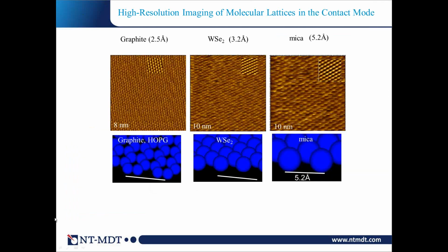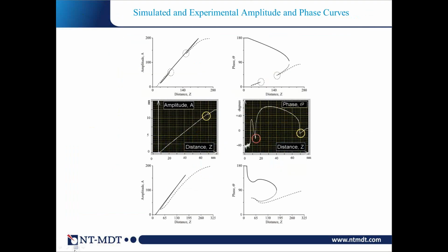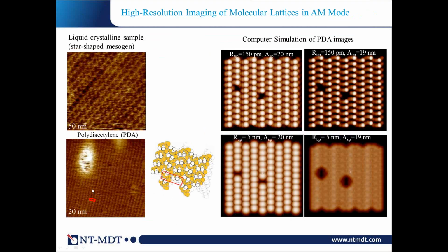Yes, we can get images, and we can get defects, which is evidence. Now the question was, do we learn much from that? This is again in simulation, in work we published with Sergei Belikov somewhere in 2006, where simulations show true atomic resolution on the lattices. We take this polydiacetylene crystal, of which we get a lot of these images.